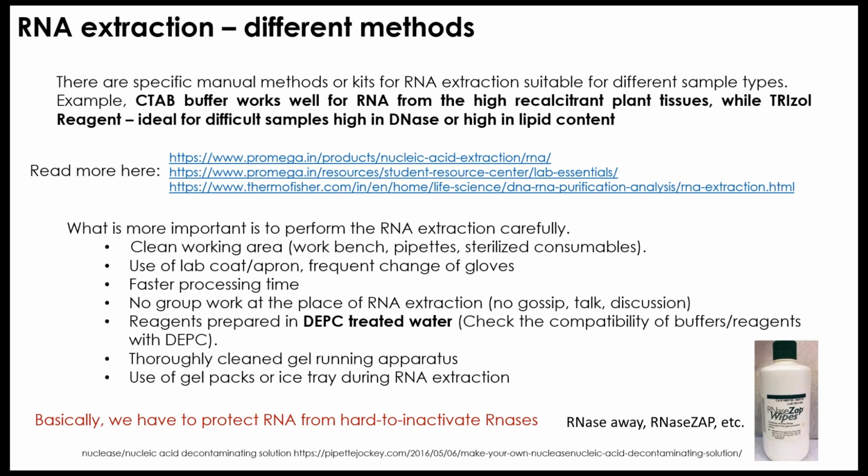Another thing which I generally suggest is that if you have to do the RNA extraction, you should do it first thing in the morning, because at that time you are much more attentive, and the chances of getting anything wrong are much less than working in the evening or late evening when you are already exhausted with the full day of work, right?